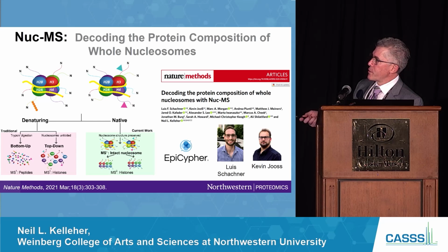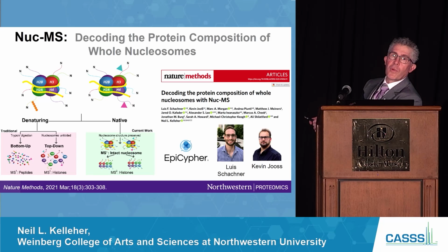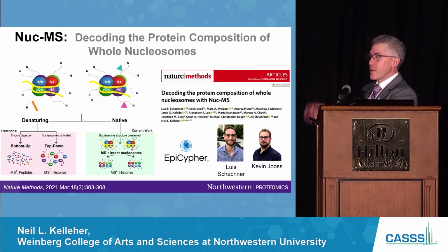You know about chromatin biology, where you have 4 histones, 2 copies each, in this nucleosome structure. And this will be important for what CZE resolved, which is these ragged ends. This should be 147 base pairs wrapped around 8 proteins. But actually, it could be 148, it could be 149, it could be 150. The enzyme that cleaves here can leave these ragged ends. And so that's the punchline.